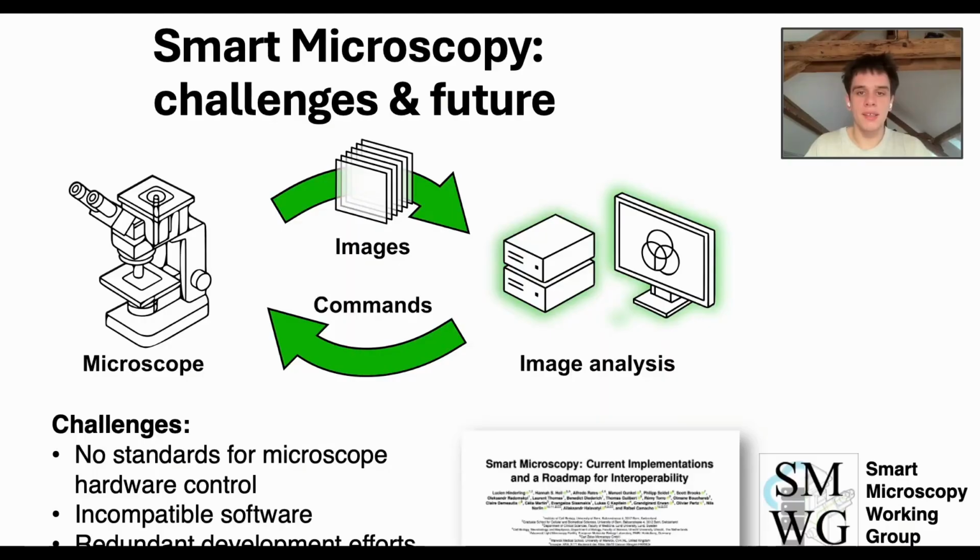So I'm really excited that there's the Smart Microscopy Working Group that brings together people from industry, but also different labs to think about how we can standardize these kind of workflows and come up with common APIs that allow to transport these workflows from one microscope to another. We've recently published a paper called Smart Microscopy: Current Implementations and the Roadmap for Interoperability, where we tackled exactly this issue and come up with a plan of how we could achieve this.